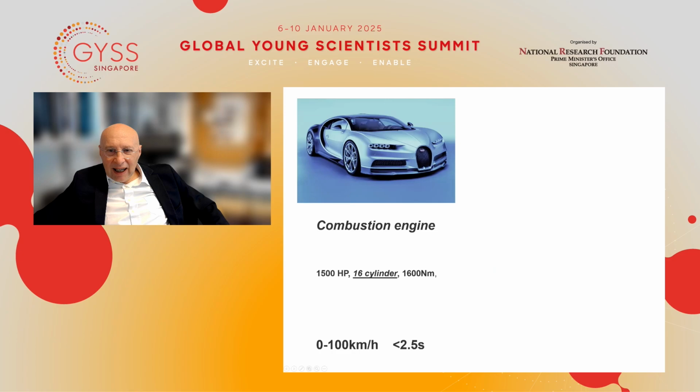And since I'm coming to the end, I just want to make a little pun here. MINFLUX compares to the old type of localization like the electric vehicle to the combustion engine. With a combustion engine, you need to scale up the number of cylinders in order to have a high torque. And this Bugatti, which is a very fancy car, very expensive, has 16 cylinders. A normal car has 4 cylinders, but this one has 16, but it doesn't scale really. You see, it scales very badly. 4 times or 8 times the cylinders doesn't really make it much better.